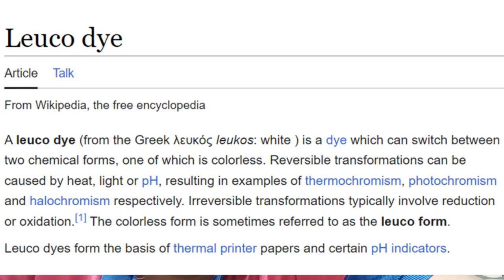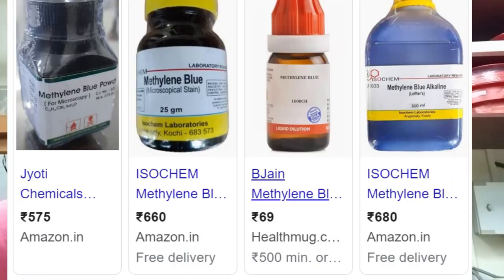Hello everyone, today we are going to make a liquid called Leuco Dye. Leuco Dyes are dyes which change color when exposed to light. We are going to make Leuco Dyes using Methylene Blue.